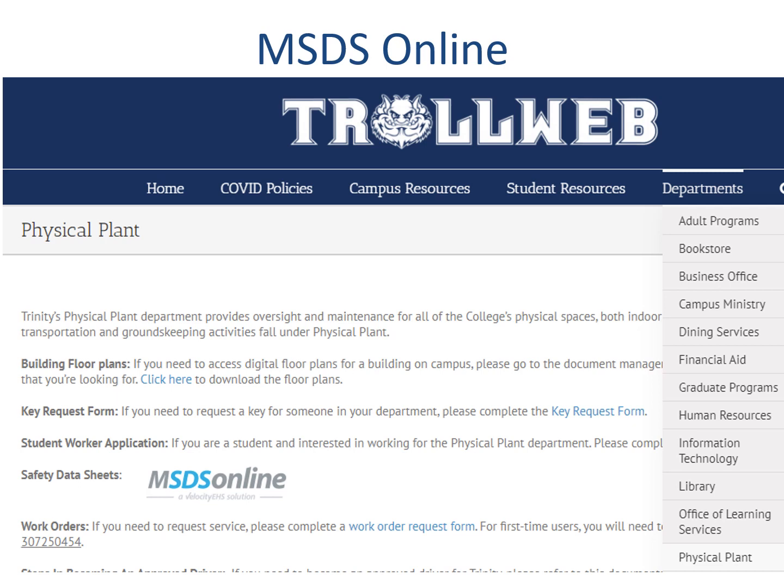In addition to the GHS symbols, hazard information for any individual molecule can be found using the MSDS, or just SDS, which stands either for Material Safety Data Sheet or just Safety Data Sheet. You can find all of them digitally through TrollWeb.